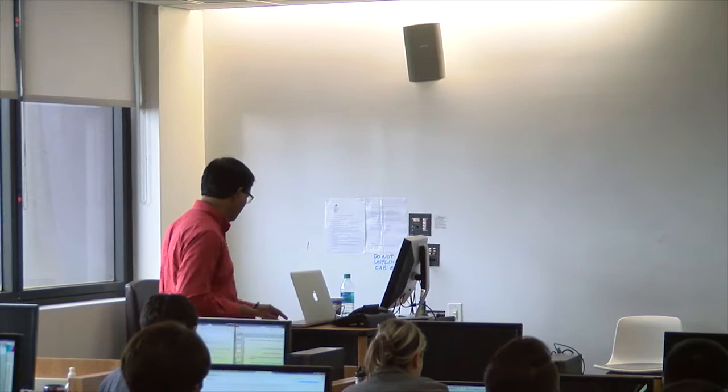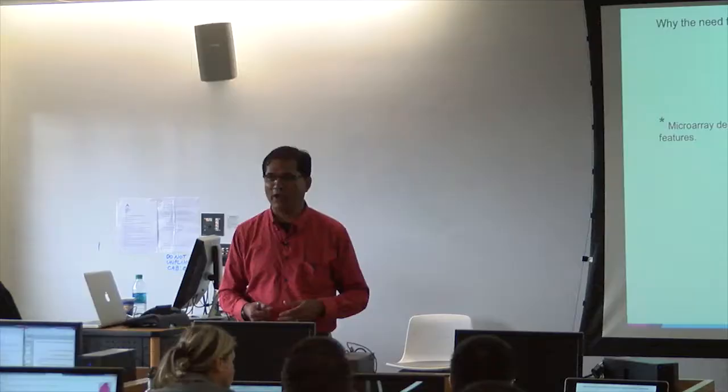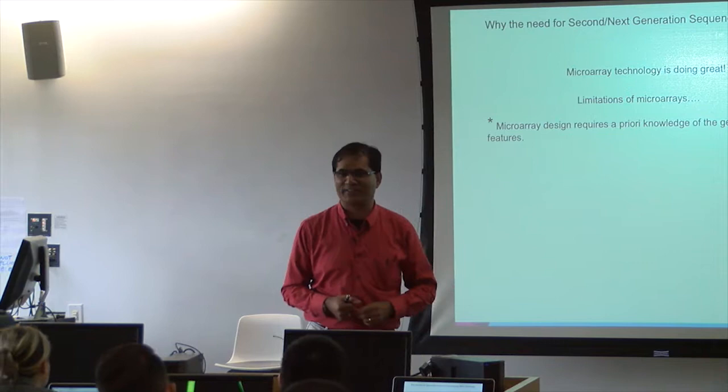Microarray design requires prior knowledge of the genome or genomic features. If you don't have prior knowledge, we cannot develop microarrays. We need to sequence. Suppose you want microarrays for the mouse genome. We can't. You have to sequence the mouse genome. Similarly, for a microarray of the monkey or a plant, we can't. We have to first sequence that, then use it as a reference to develop microarray technology.